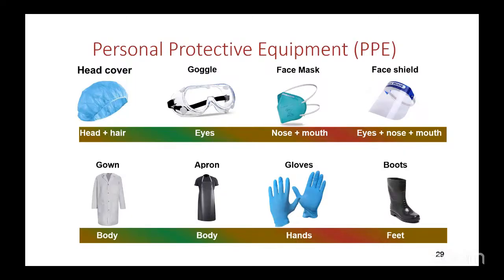So I have never carried a sample with my bare hands without a glove. Someone will say, oh, if we don't have gloves, what do we do? Is it that we should not work? You shouldn't work without your PPE, or else you expose yourself. At the end of the day, you can take some of this exposure to even your family, your loved ones, your friends, etc. So you have to work with the required personal protective equipment. This is minimal.